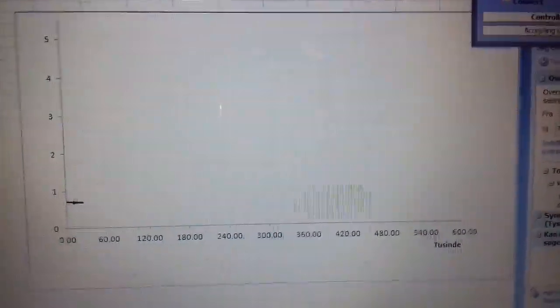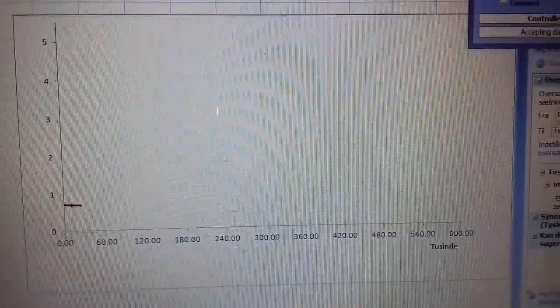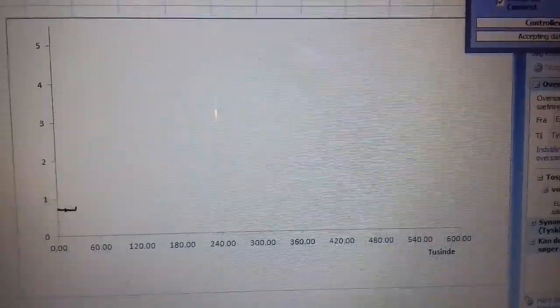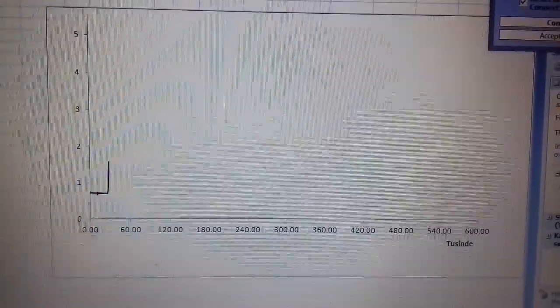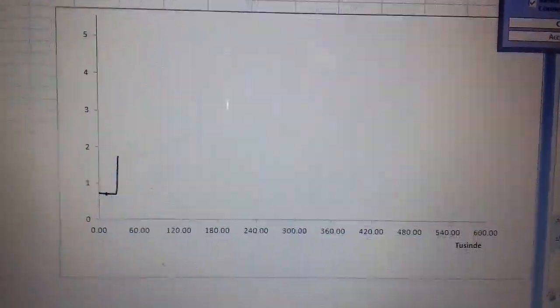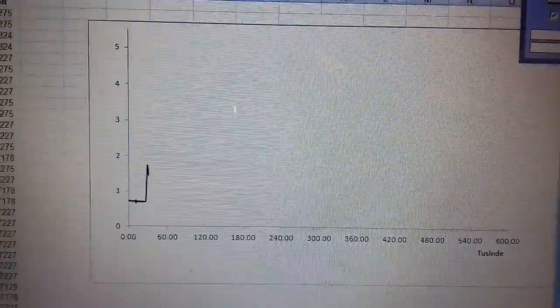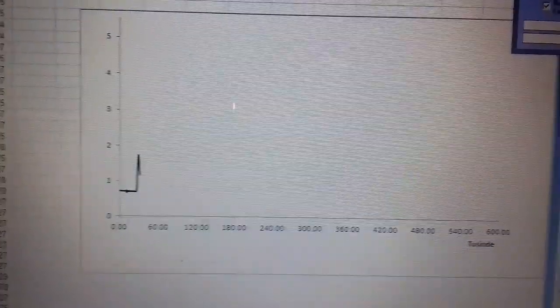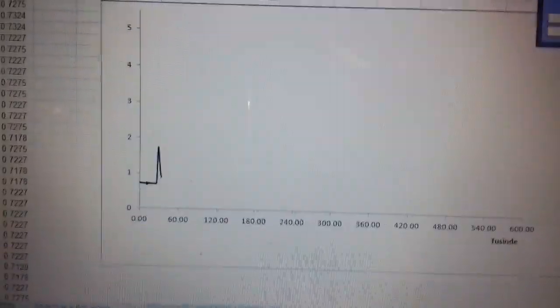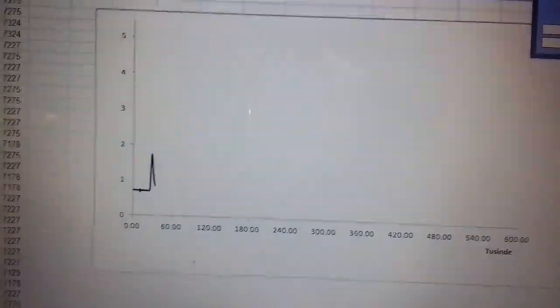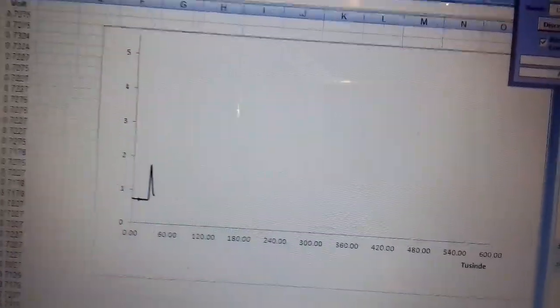The sample injected is a propane-butane fuel mix with some air. That's the air you see there as an unretained peak. The other peak should come shortly.